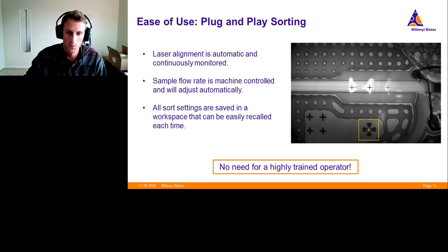As cells pass through this channel, they're interrogated by the lasers. The system will validate which cells are of interest, and then it opens up a valve, which is located on the right side. We have lots of cool videos on this on our website that will allow passage of your cells of interest.